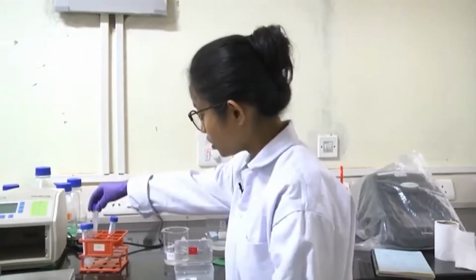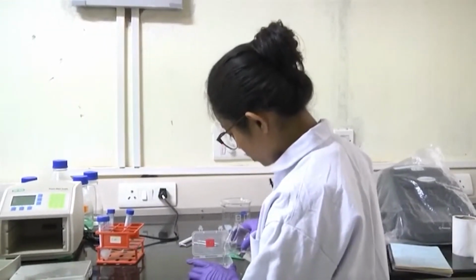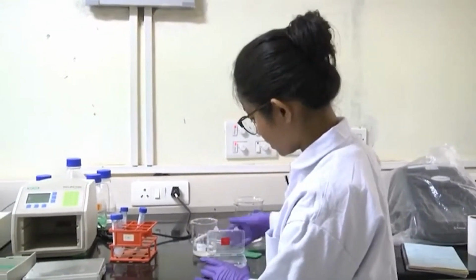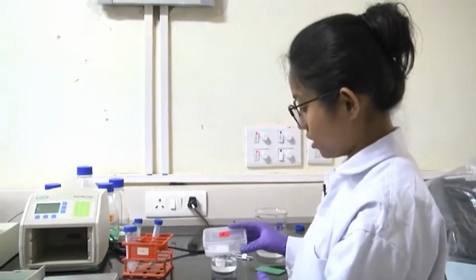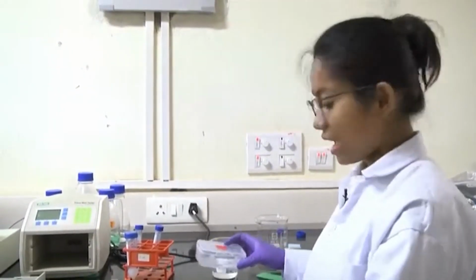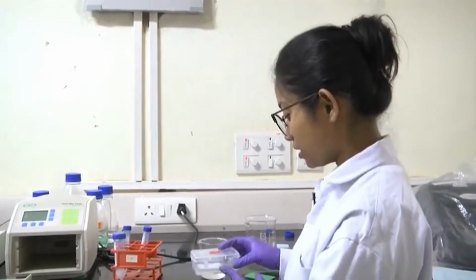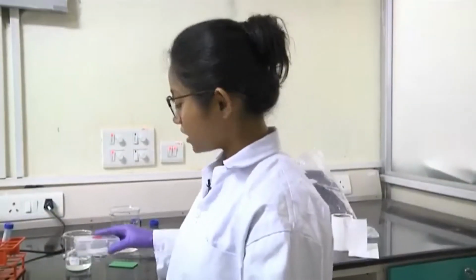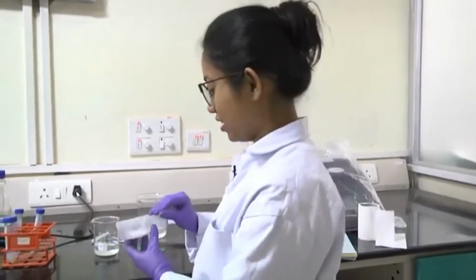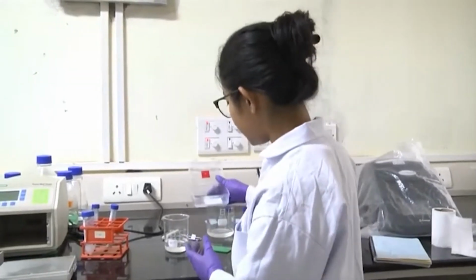And I will wash it with the TBST buffer. So I will put a few ml of TBST buffer, 10 ml almost, and keep it 5 minutes in the rocking motion, and like this I will wash it thrice. So 3 times I will wash it with the TBST buffer. So this is the last time I am washing. So I have washed the membrane 3 times.